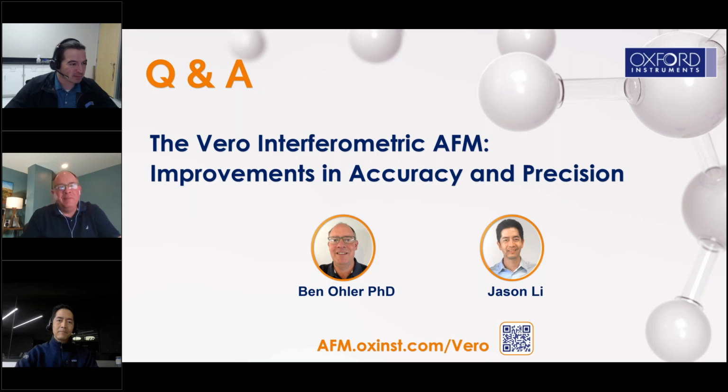Yes. So we support the same accessories on Vero that we do on the Cypher S and the ES. The one exception, the one thing that we just haven't really gotten around to testing yet, is the electrochemistry cell for the Cypher ES. We haven't confirmed that it's compatible with Vero yet because it's quite a bit different in how it all goes together. So that's something that we still need to verify.